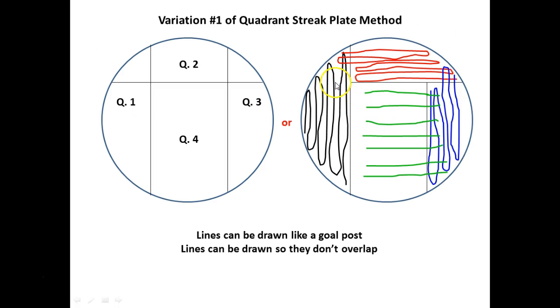So sometimes people just get organisms here and none here, or the rest of the plate, because guess what? They didn't actually pick any up from this first one. That's why you really want to cover the whole surface, so when you're going back in, you're picking up organisms. Does that make sense? All right, good question.